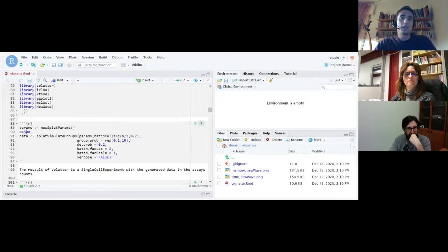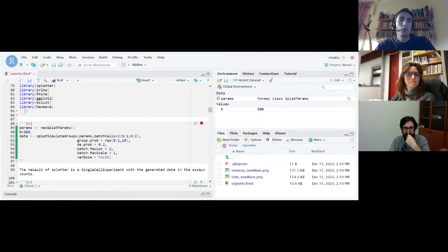We will see that we will not have an improvement in time consumption using more than one core, but I think that it is related to Orchestra because we don't have more than one core available for this workshop. So in a real case situation on your laptop, this will work, but now it will not work. So I will go to generate data.